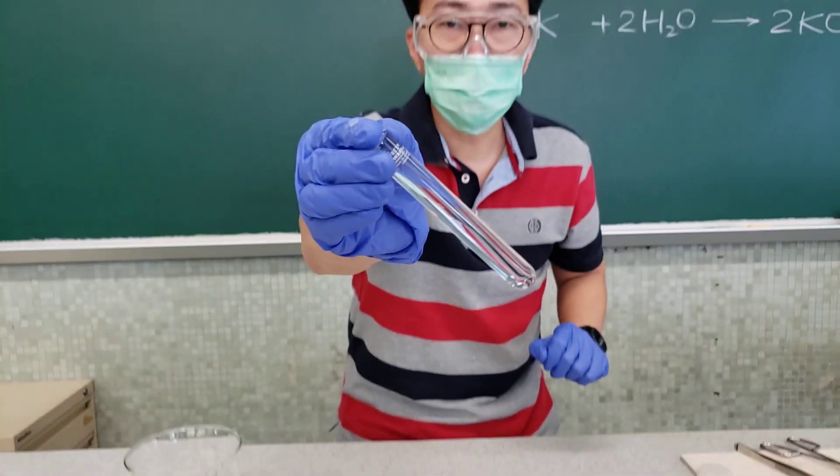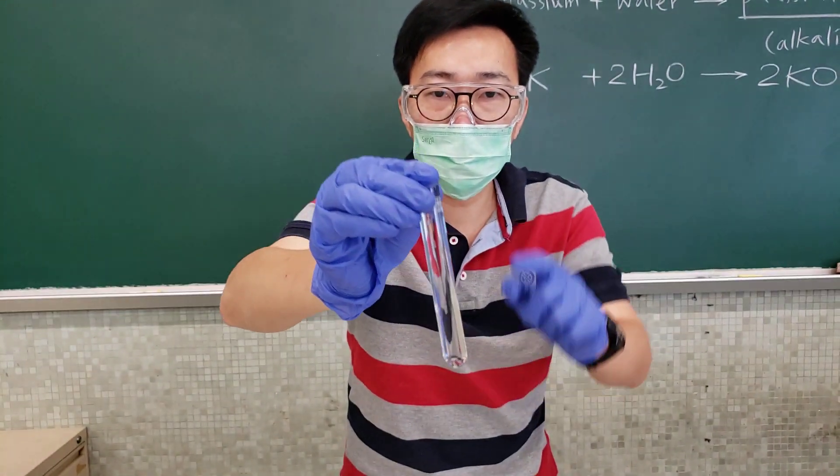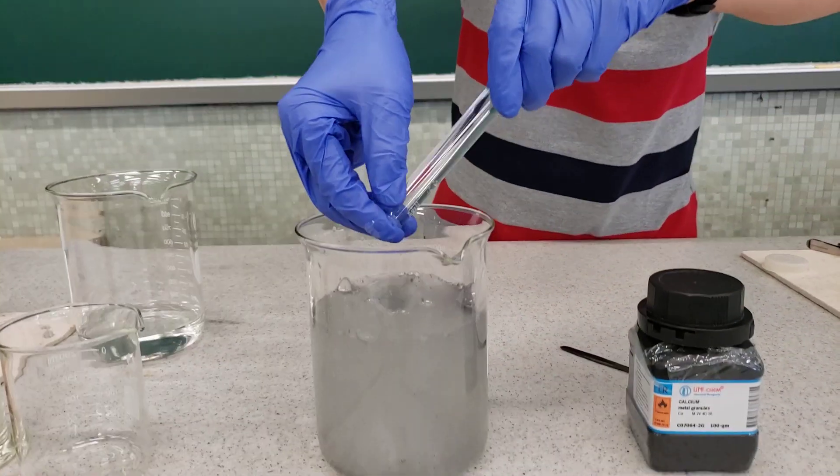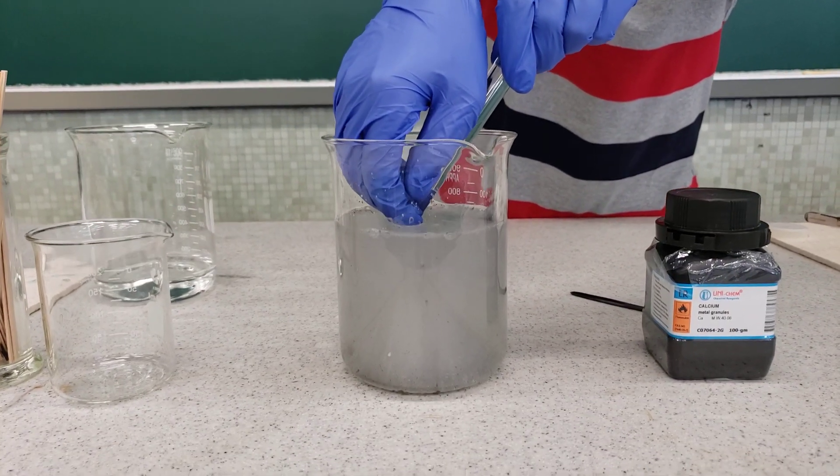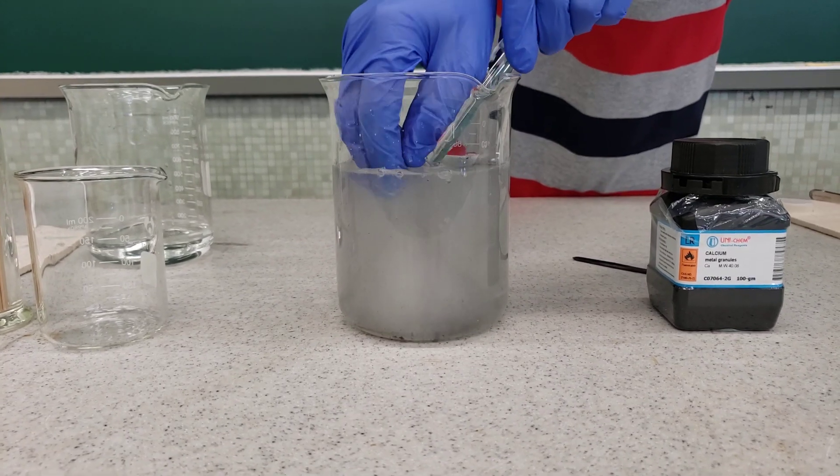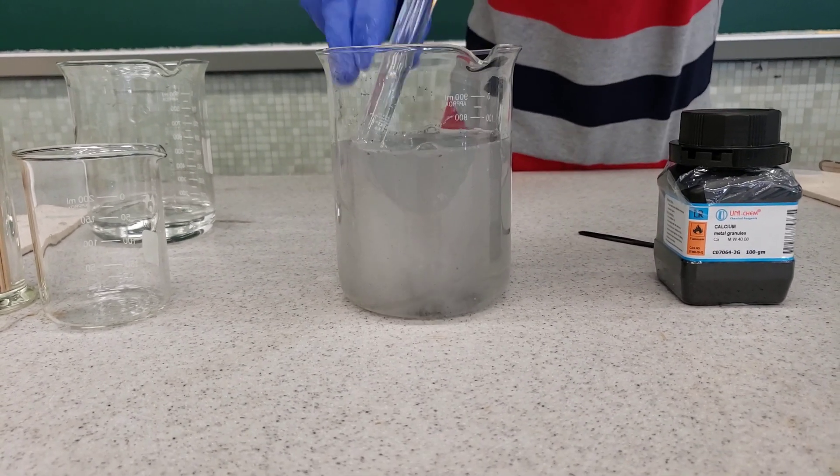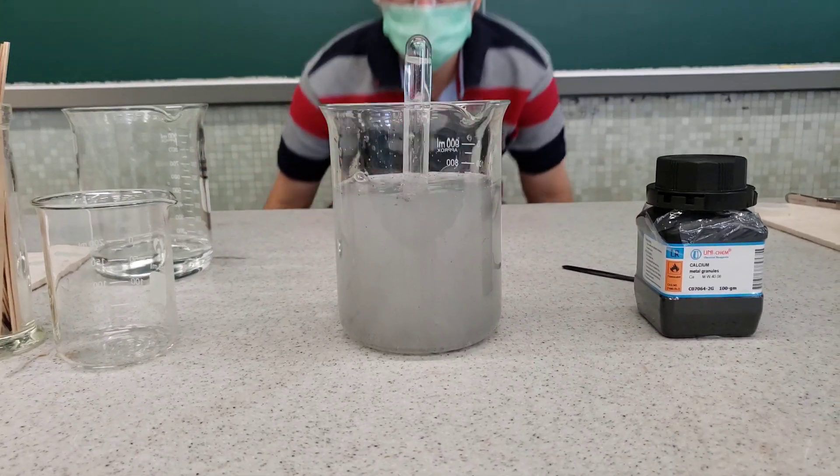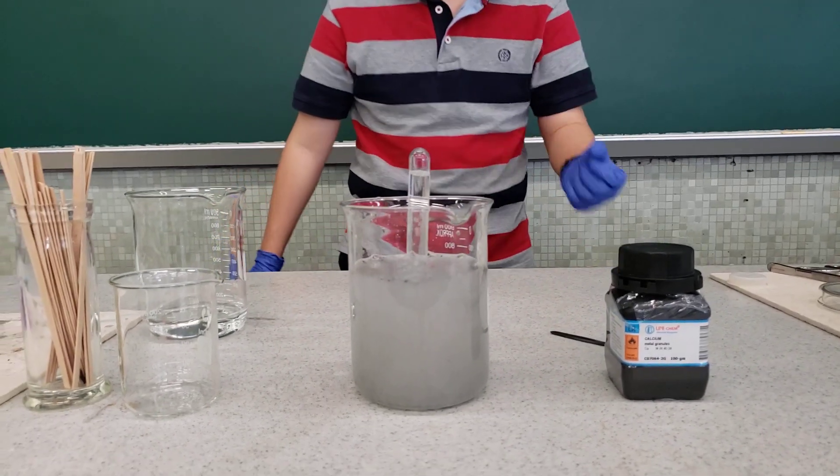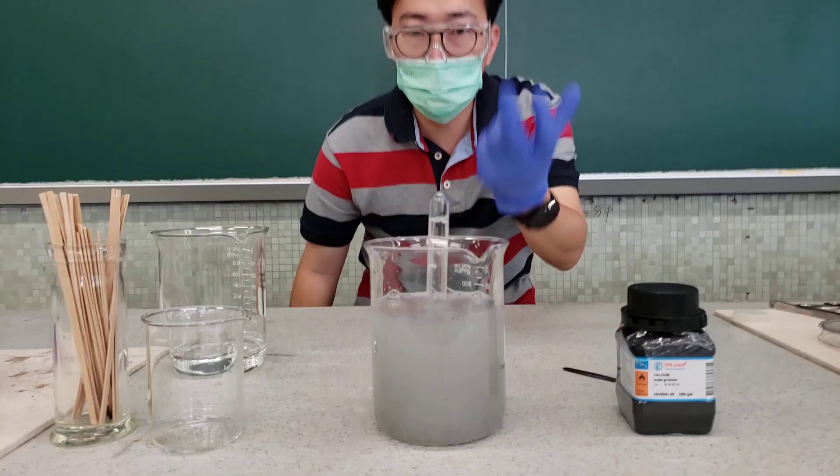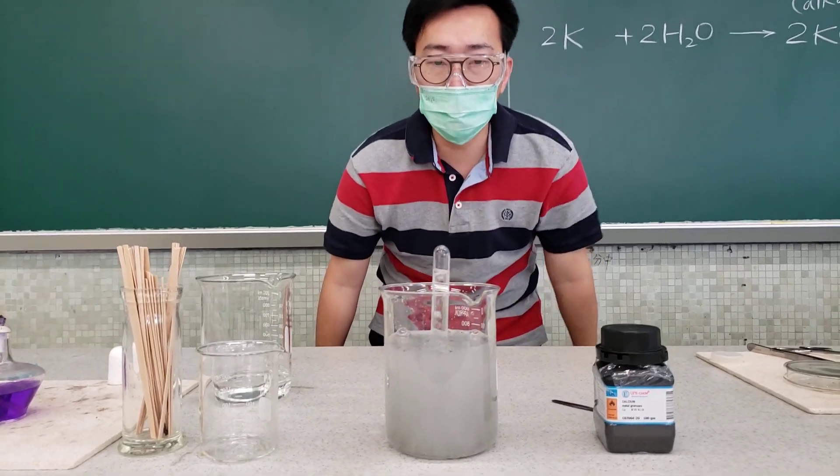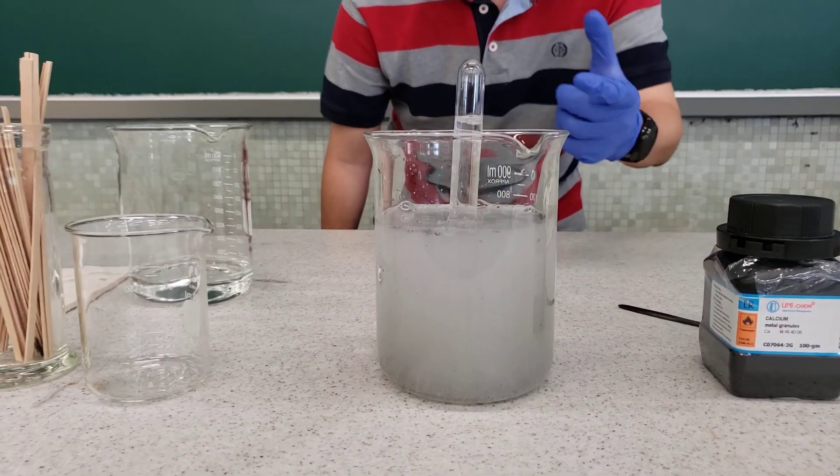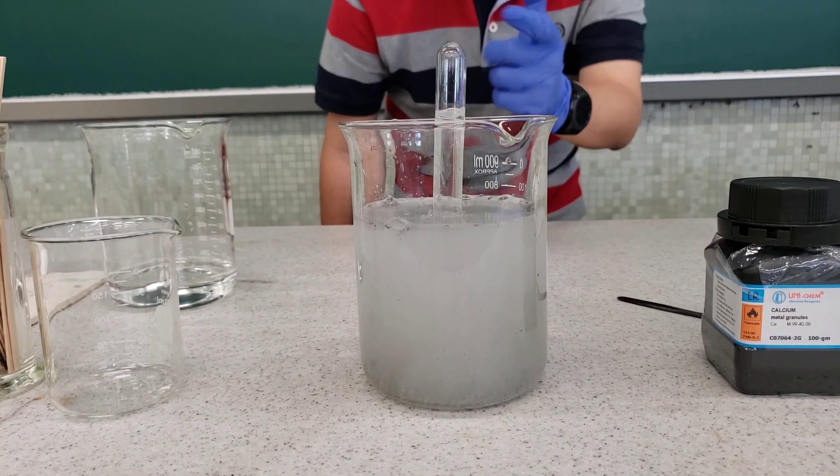I'm going to collect the gas produced using this test tube. This test tube is already full of water. I'm going to put this test tube into the setup. You see the gas is produced and collected by this test tube already. Later on I am trying to test for the gas. What is the gas?